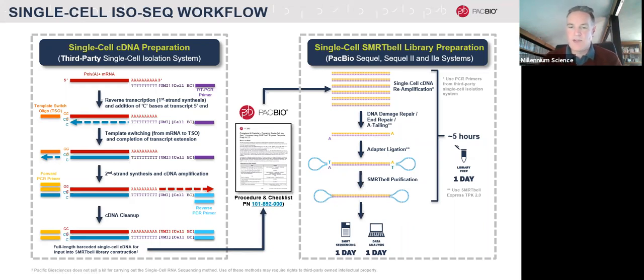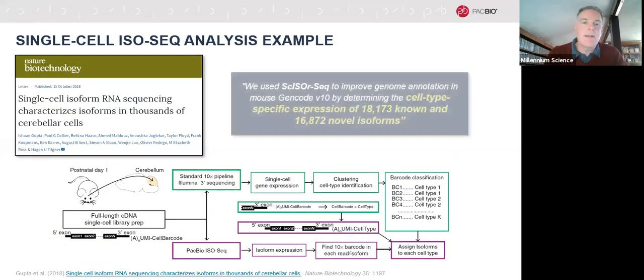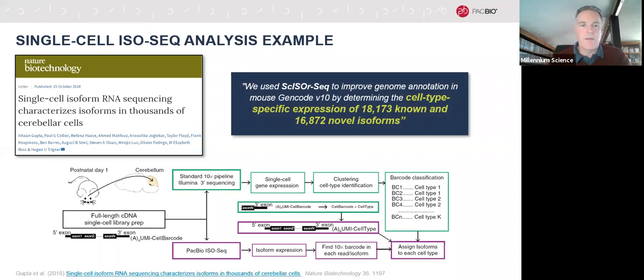And therefore, if you're sequencing through that molecule, you're sequencing through the cDNA, but you're also sequencing those unique molecular identifier tags and the single cell barcode tags, which gives you the power to show which transcript comes from which cell and how many transcripts of a particular gene you get in each cell. And there's an example of that here in a publication from mouse, and a little cartoon diagram of really how it was done. So this is from a mouse brain sample.